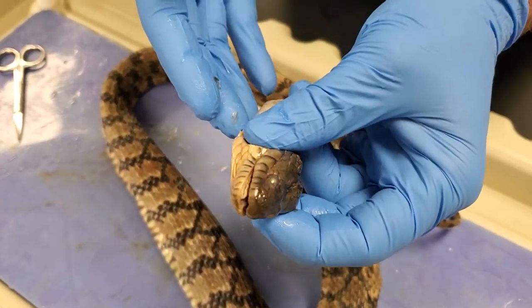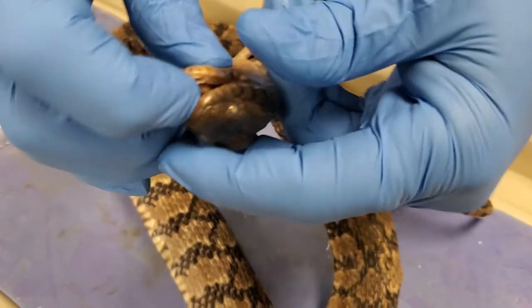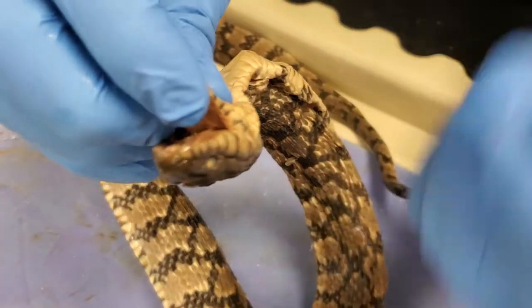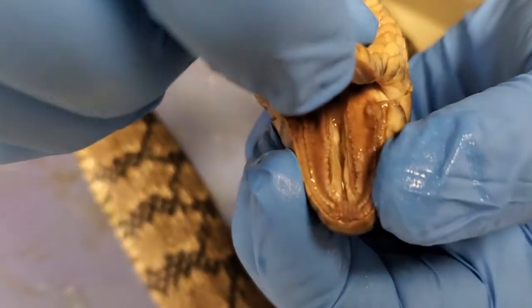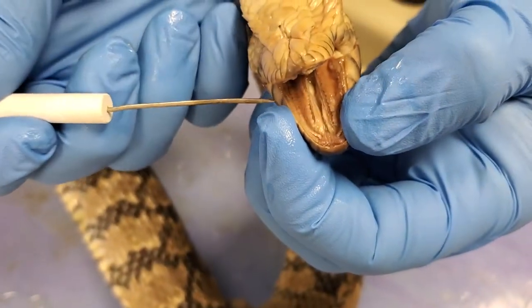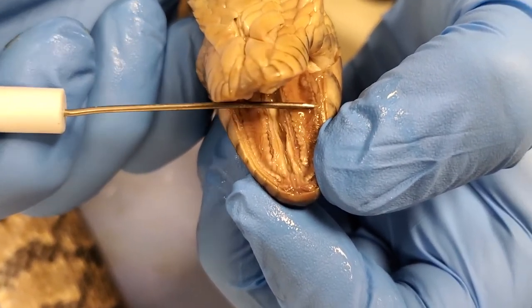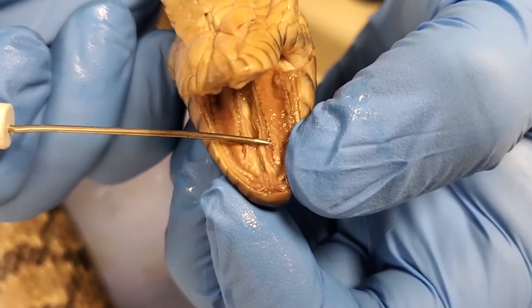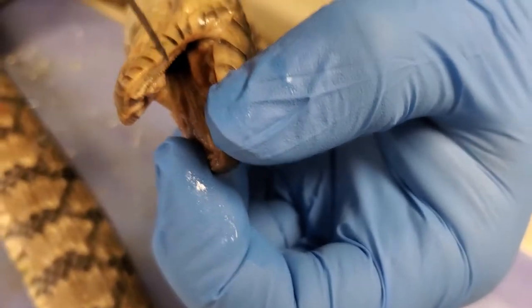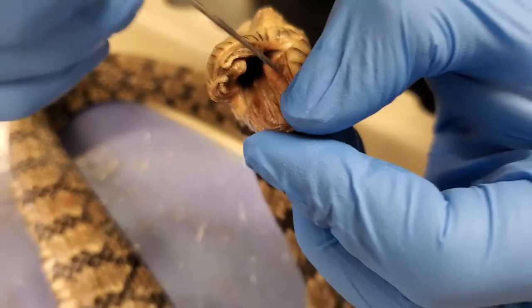So this is confused with cottonmouths slash water moccasins out there in nature, but it is not — there's no fangs in here. And if I do open the mouth, it just poked my fingers. There are teeth in here. Snakes actually have an extra set of teeth in the roof of the mouth. They have this set all the way around, but they have another row right here and another one right there. So if a snake bites you, you'd have four strips of teeth marks from the upper bite, or only two from the lower, because there's only two on the bottom — the left and the right — rather than having those extra rows on the top.